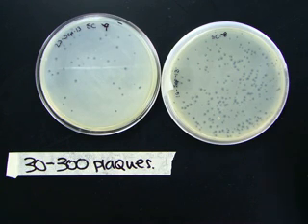Hey everyone, today we're going to be talking about how to count your plaques and then how to use your plaque counts to calculate the titer of the phage lysate that you have. We are assuming by this point that each of you have flooded a plate, at least, and so you have a tube containing phage buffer with virus particles in it. This is called your phage lysate because the host bacterial cells have been lysed to release the virus particles.